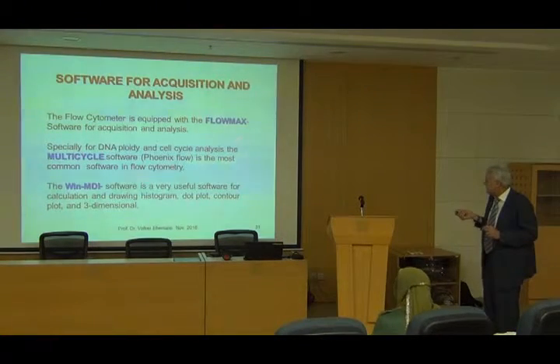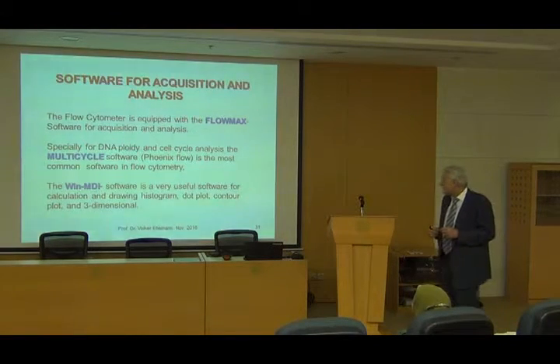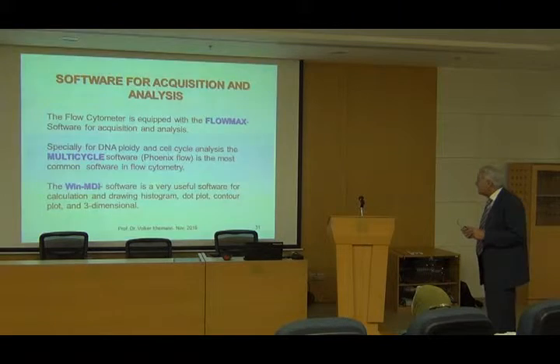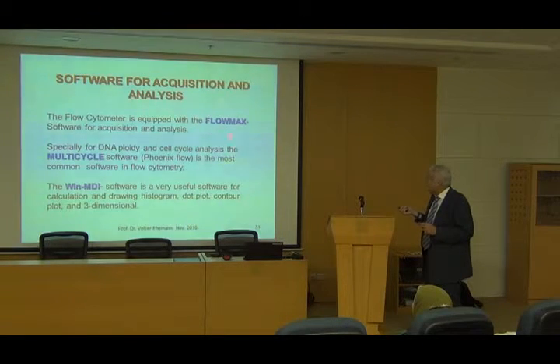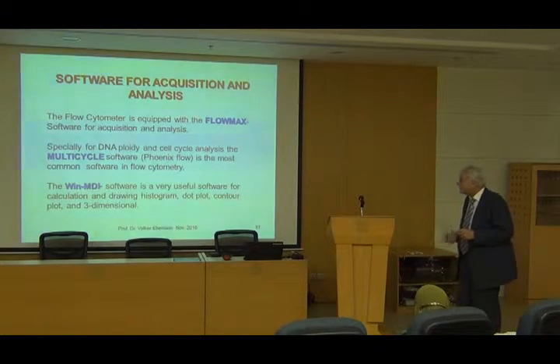The FlowMax software is installed in Partec machines. Also, the Multicycle and the WinMDI software. For BD machines, the software is CellQuest, as you have here in your lab.